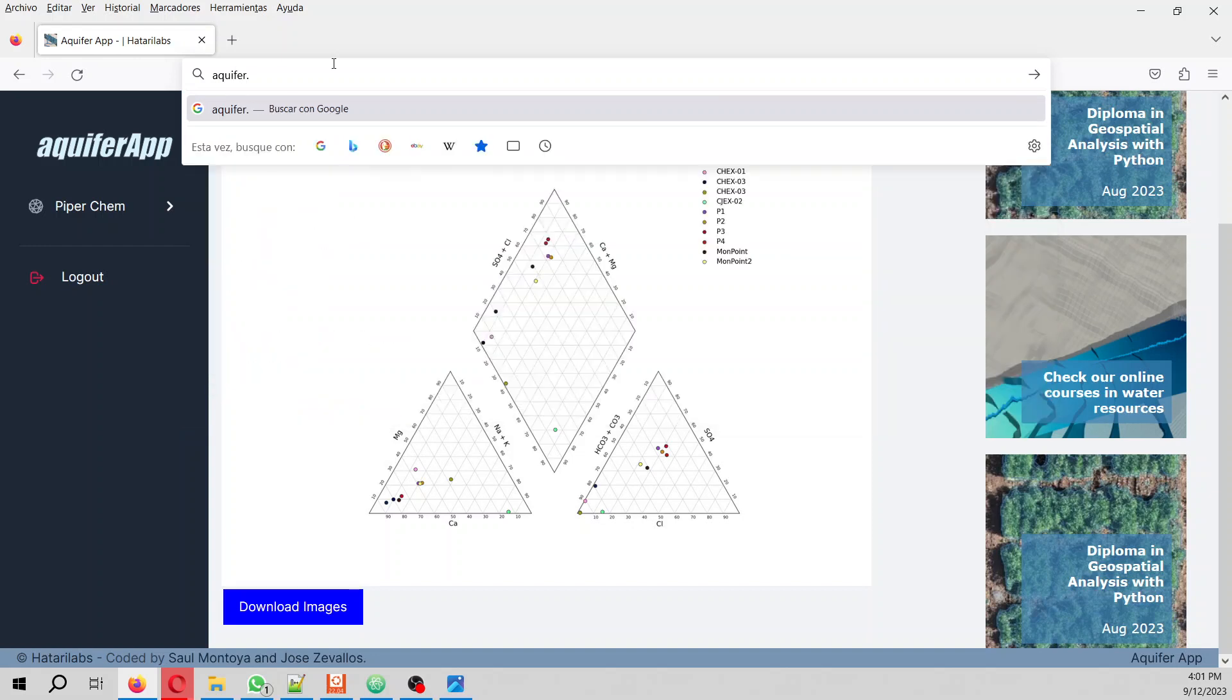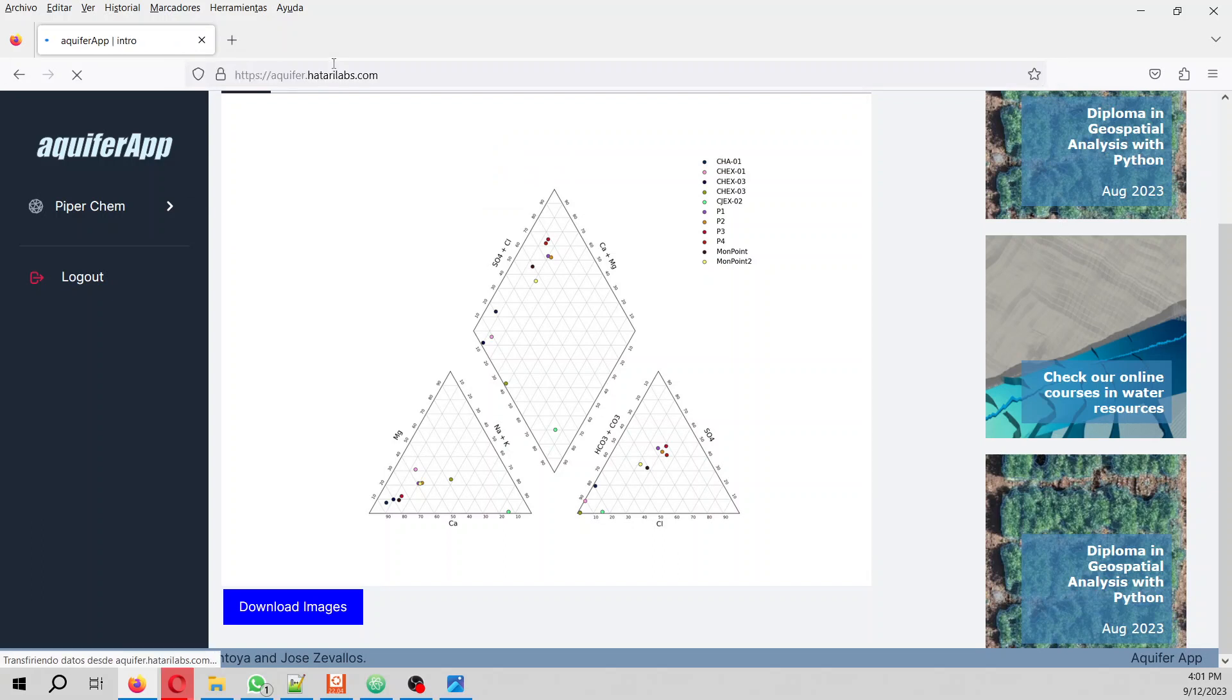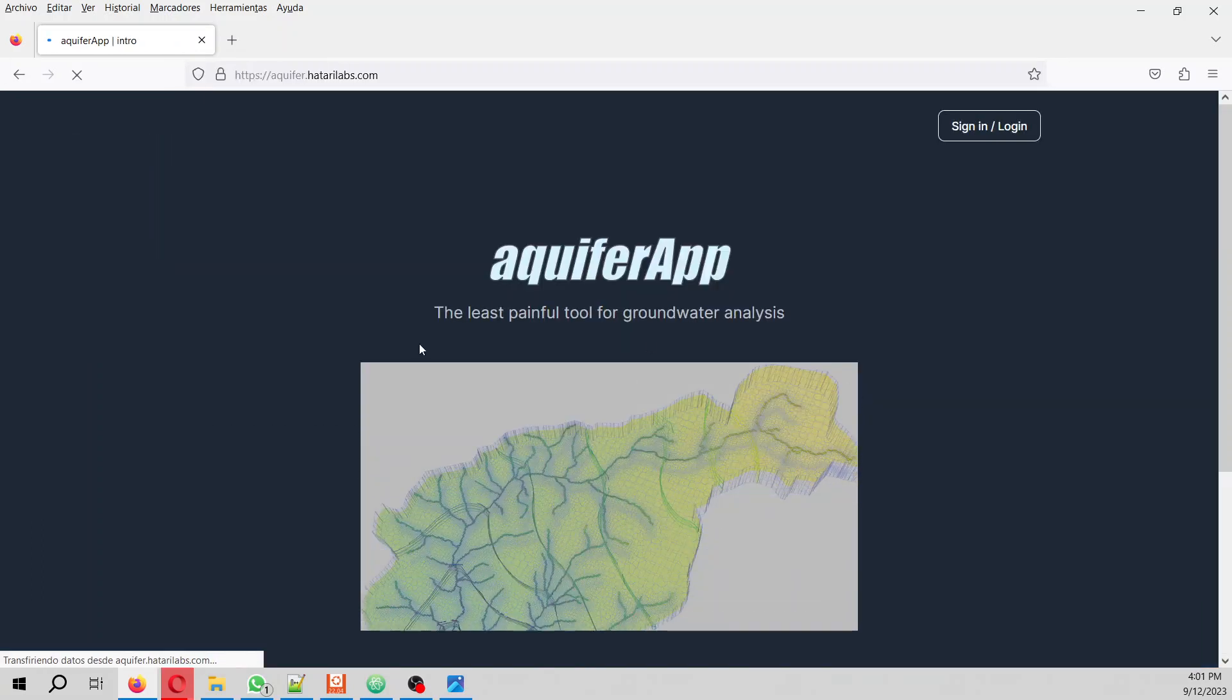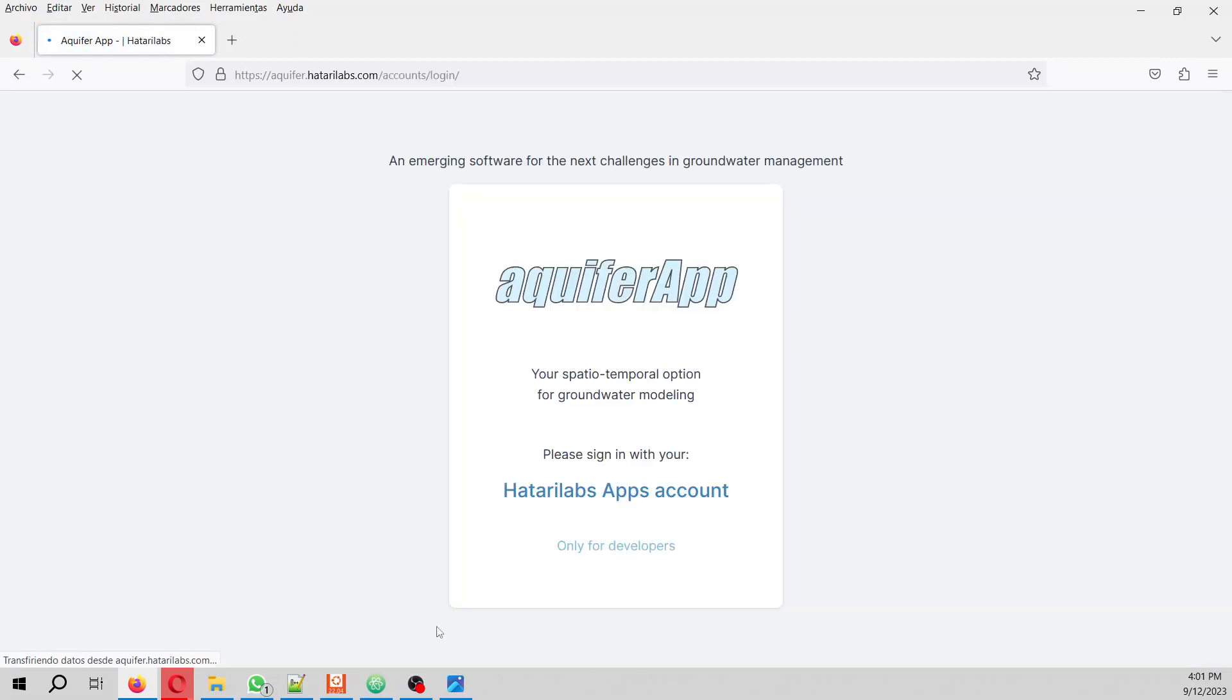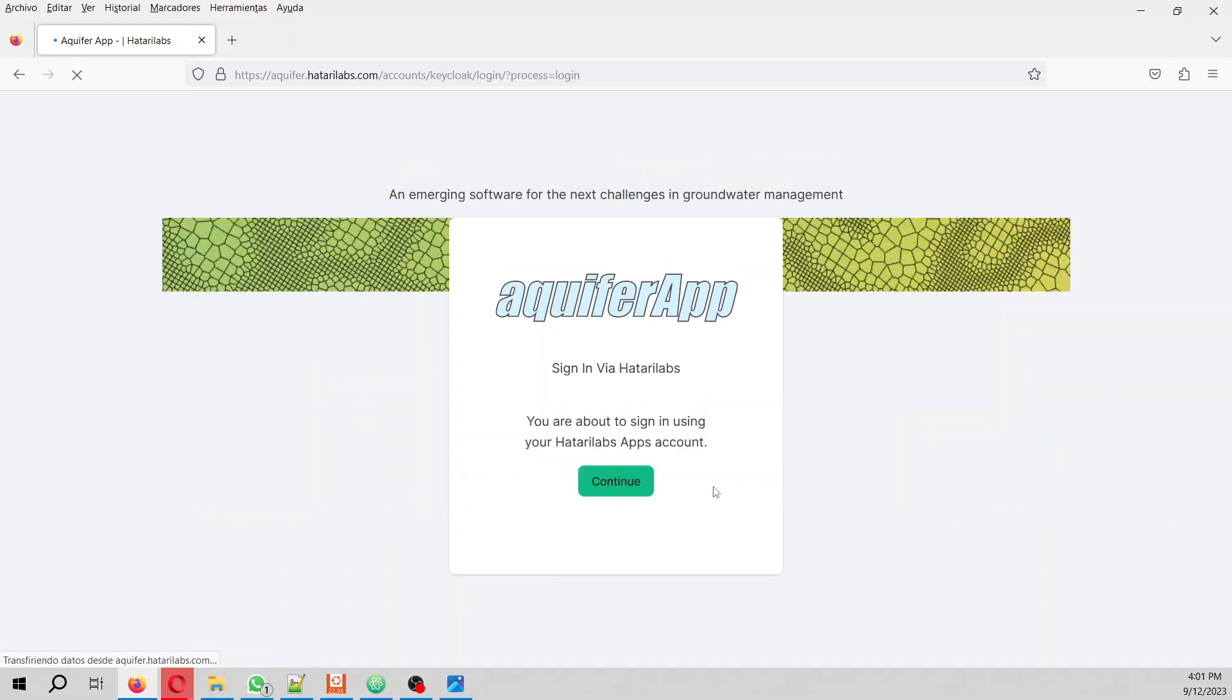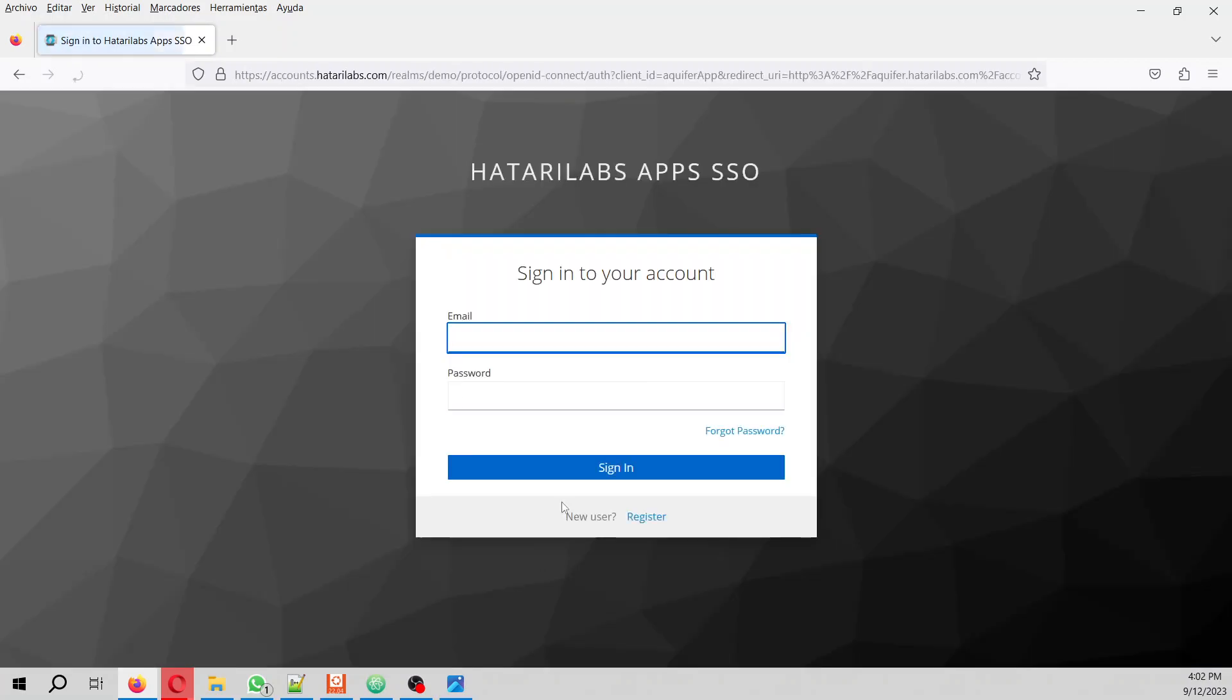you have to type aquifer.hatterylabs.com. Here you are - the least painful tool for groundwater analysis. Here we sign in. You need to have your Hattery Apps account that maybe you might have, otherwise you can register. This is entirely free. With my email and password I can register.